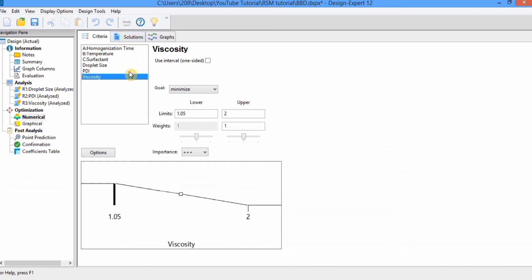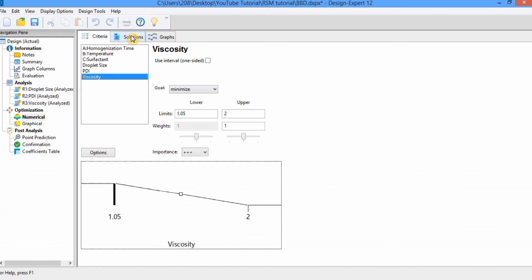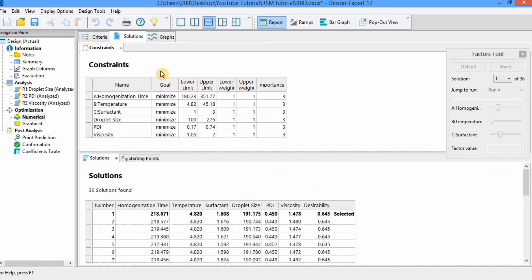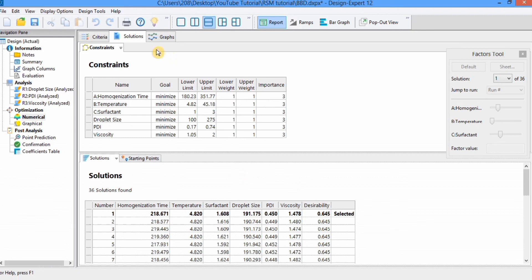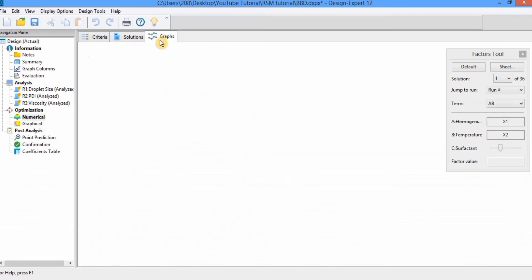After selecting all goals, go to the solution tab. Here you will find the goal, lower limit, upper limit, weight, and importance you have set. You will also find the solutions — there are 36 solutions. Select the solution with the maximum desirability; ideally it should be 0.7 or above. You can also use the graph option if you are interested.